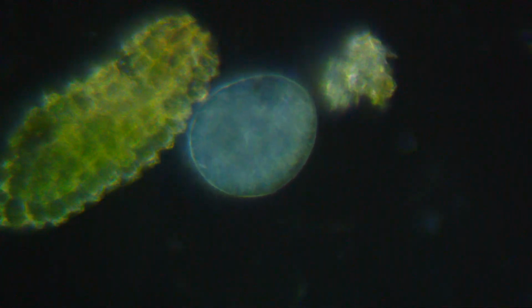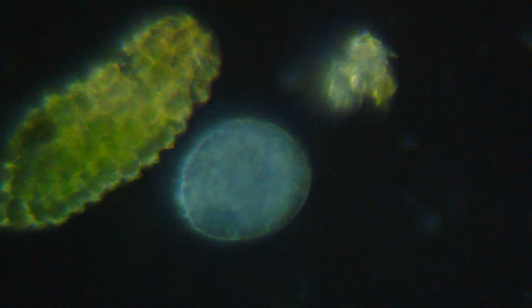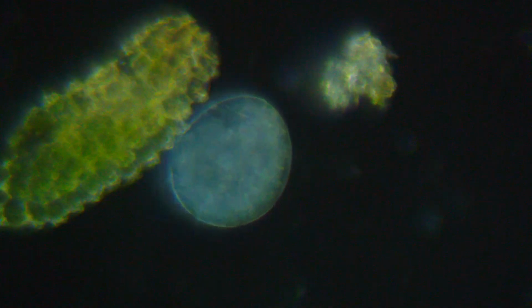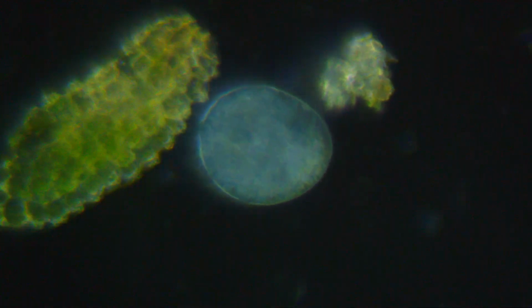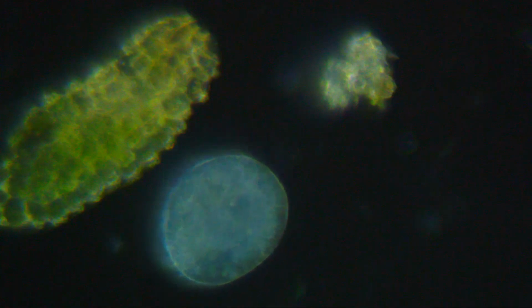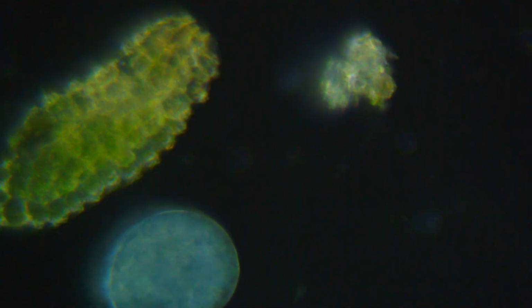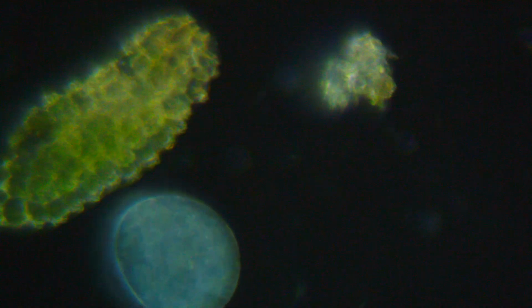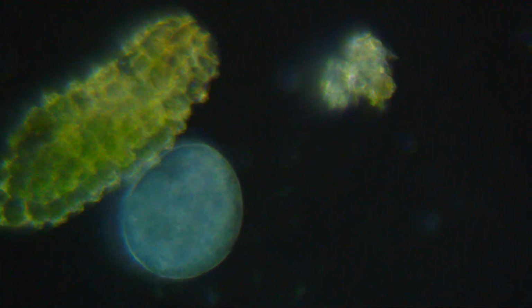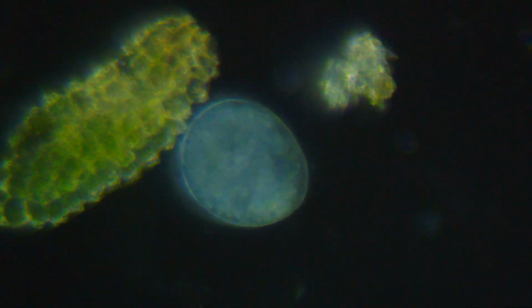Oh, and if you look really closely there, it's hard to tell because it's kind of out of focus, but now if I... maybe I can... Yeah, that's about as good as I can get it there. There's smaller things in there moving around, and this critter is probably covered in cilia, little hairs, and he's able to propel himself through the water by using the cilia. And you can see all these objects that are being pushed aside as he's moving.